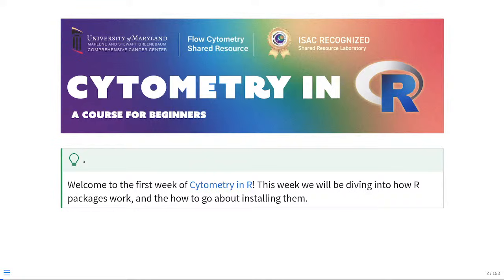So this is one of the reasons we are doing this course. First off, it is a passion project, but I have learned how to do cytometry in R the hard way, by literal cycles of trial and error, eventually figuring out how to do things. So I do have a good context now as far as what's happening within the language. It's no longer so much of a black box. So I'm like, okay, we do need a good course on how to do flow cytometry in R that covers a lot more topics, especially for the community with everything growing as it is.